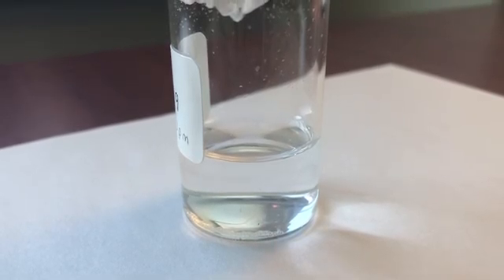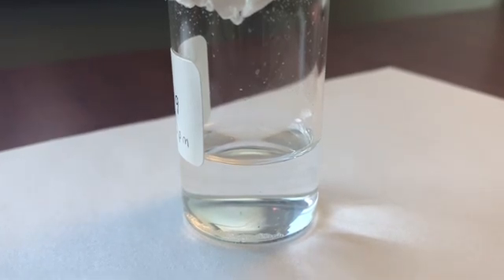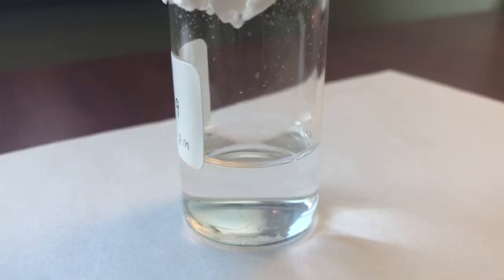Along the bottom rim of the vial, on one side, there's a line of tiny crystals forming. From what I can see, the crystals look to be of uniform shape and size, cube-like and each less than a cubic millimeter large. The crystals seem to be growing slowly, but this is to be expected due to the fact that the solvent is evaporating slowly.